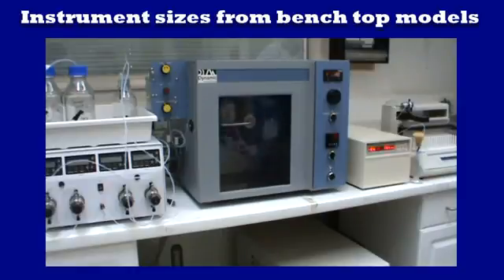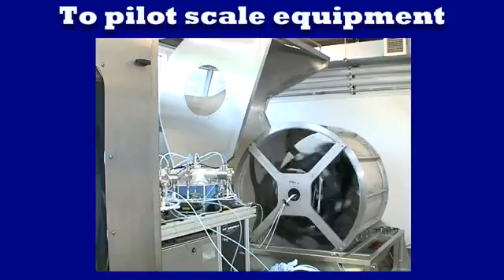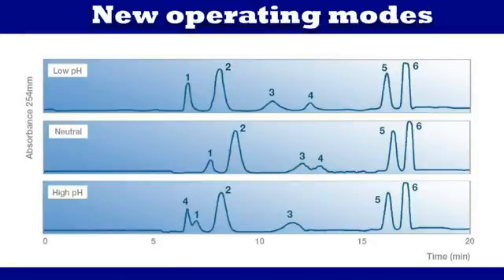Liquid-liquid chromatography instruments are available for laboratory scale work through to pilot scale. This allows for separation methods to be transferred seamlessly to larger scales. Liquid-liquid chromatography also allows new operating modes to be used, because both mobile and stationary phase are liquids. For example, elution extrusion, where after 2 column volumes the stationary phase is pumped off, reduces overall solvent usage, or continuous chromatography is possible where the stationary phase is continually replenished, enabling 24/7 operation.